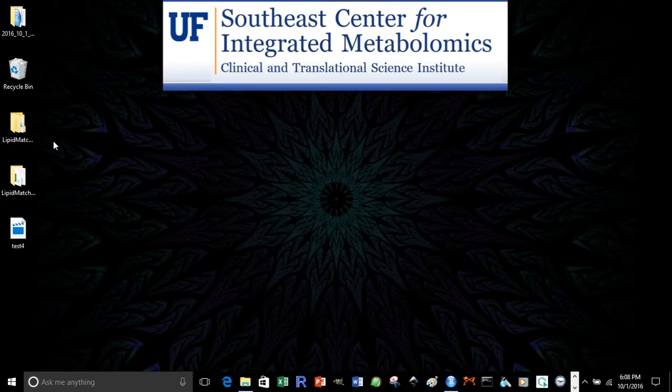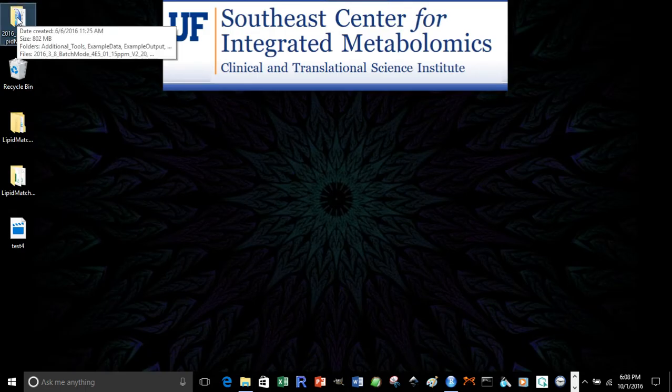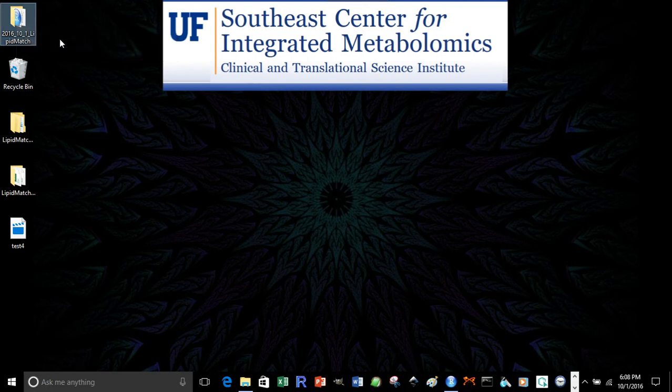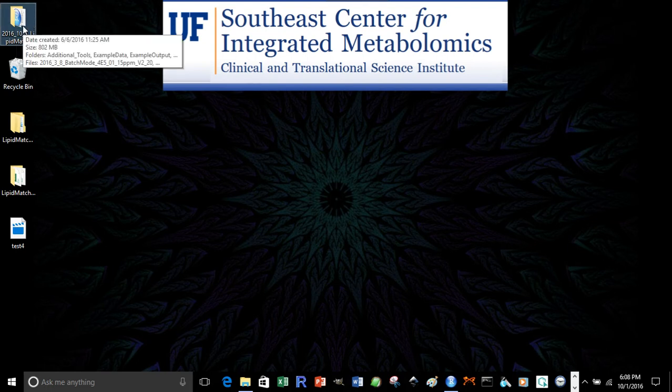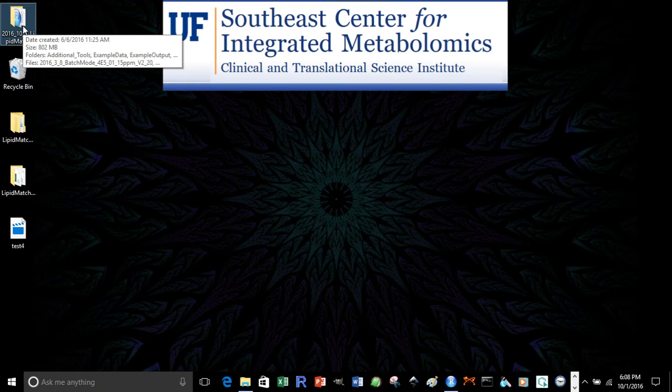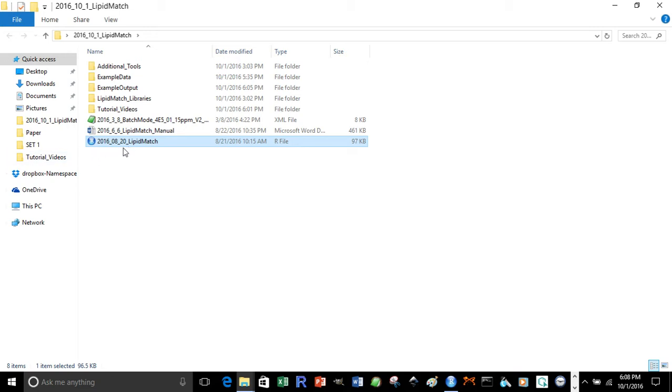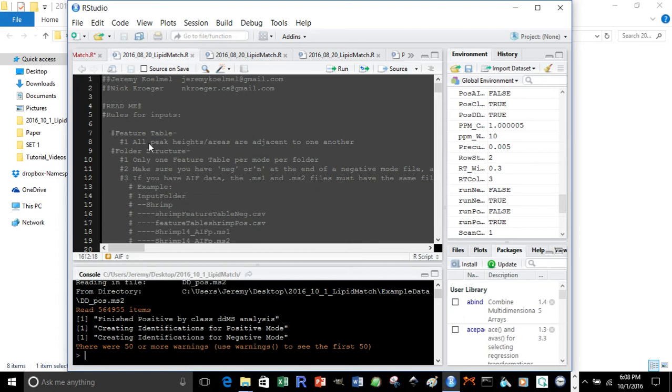Now to run LipidMatch, we go into our LipidMatch folder. It's important to note here that originally your LipidMatch folder comes as a zip file. You'll have to unzip the LipidMatch folder and make sure that you grab the folder and put it outside of the zipped file for it to work. Once you do this, you can double click the LipidMatch script 2016 in this case. LipidMatch should end in a .r.